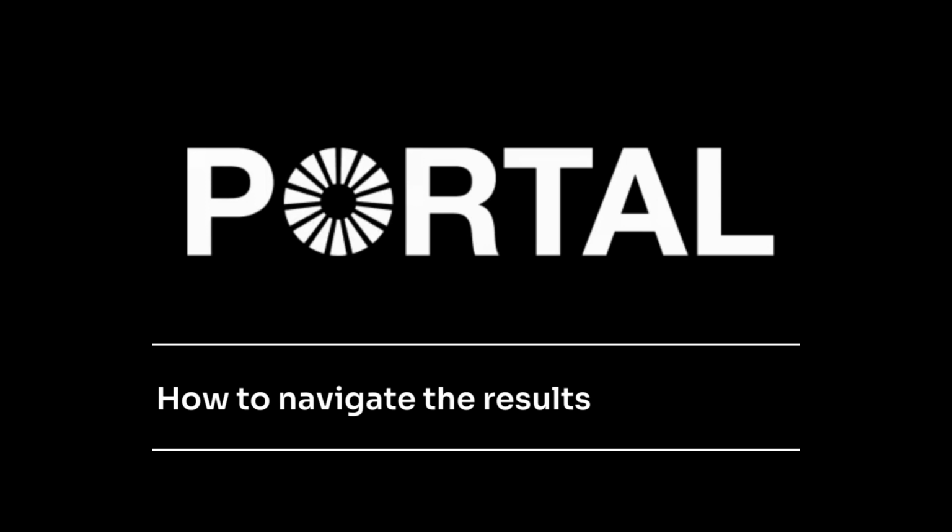Welcome to the LGC AXIO Proficiency Testing web series for our in-house reporting system Portal. In this tutorial, you will learn how to navigate the results entry screen in Portal.